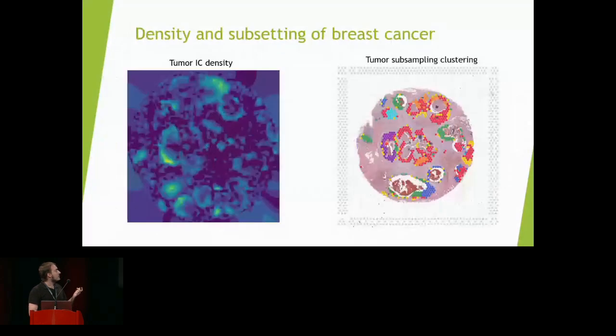In addition, the tool can also display the density of specific cell types, or allow the subsampling of your samples. Here, for instance, we subsample based on the spots that contain signal of cancer cells. And with this, you are able to re-run the pipeline in order to create new clusters and see how the cells evolve across your tissue.